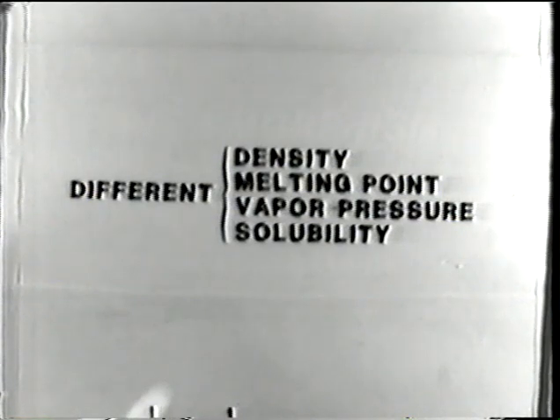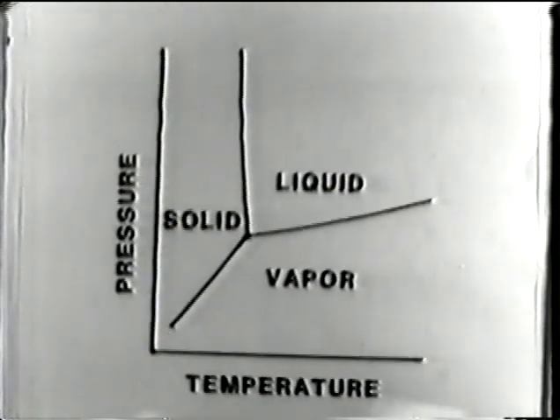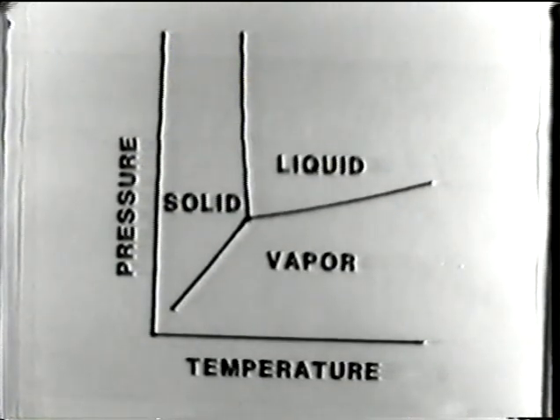No digital readout or chart recording. One has to try to interpret in terms of just what happened. Instead, you see the crystals of each polymorph individually. You can quickly detect impurities, determine relative stability, prepare unstable forms, and observe transitions, all on a microscope slide.